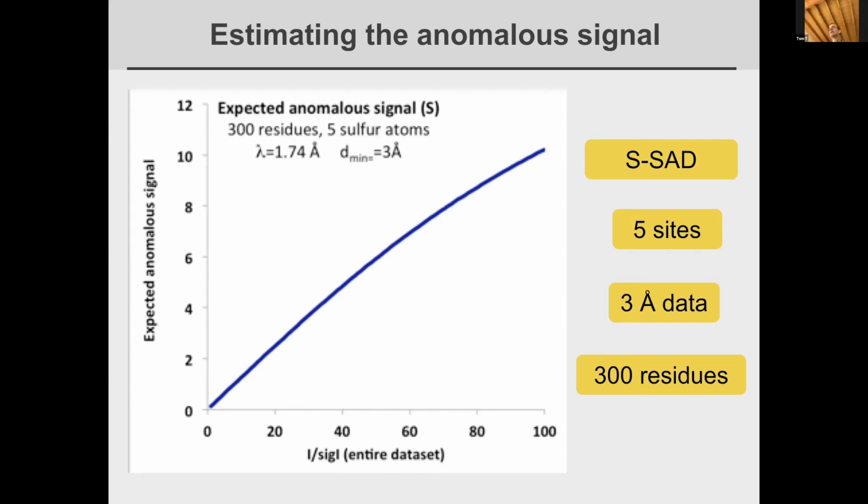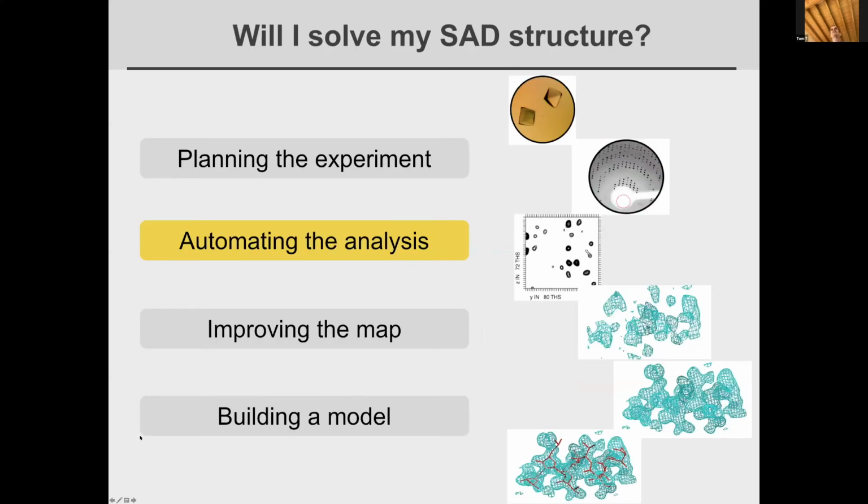Any more questions on that? Subject to systematic errors, what's the impact of ice rings? Yeah. So things like ice rings, basically you want to detect this. And if we have a chance, we'll try to detect that in the experiment we're going to run in just a second here. So let's deal with that at that point.